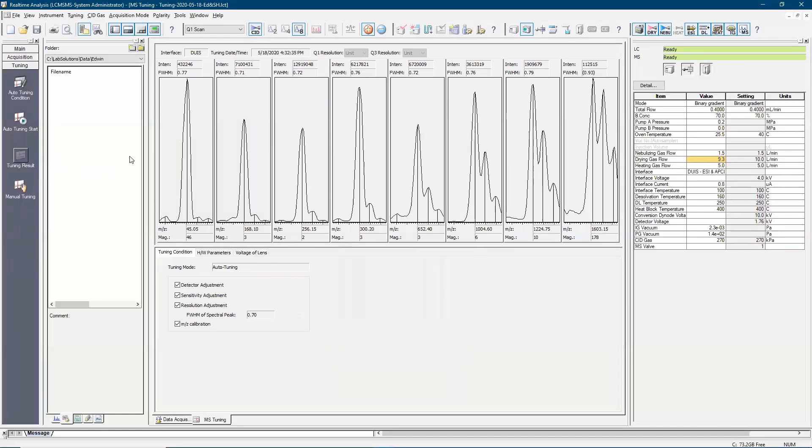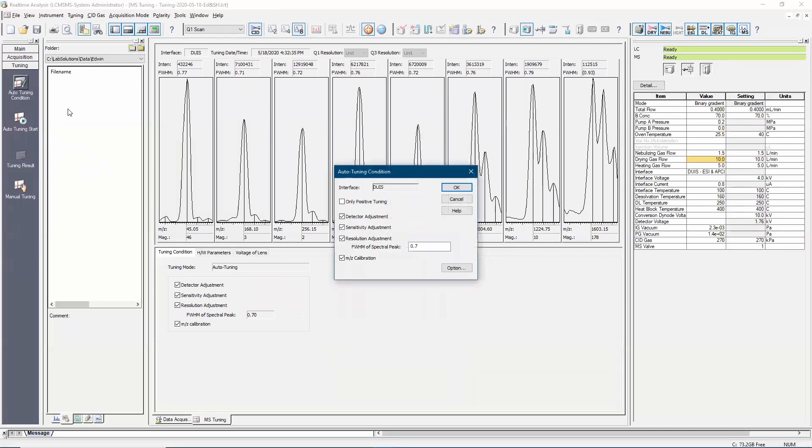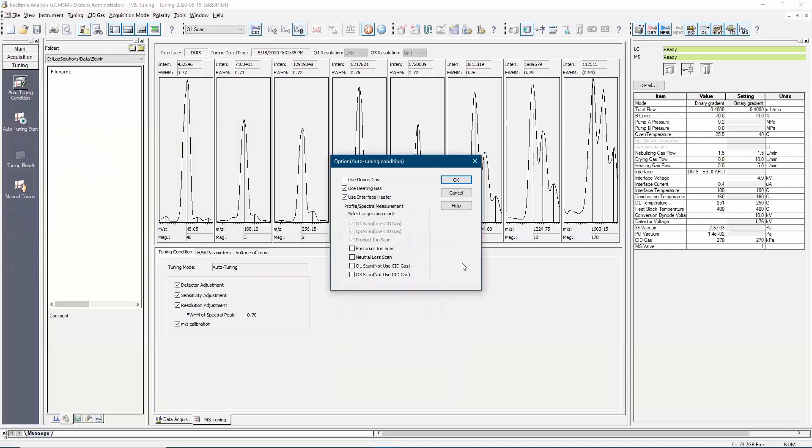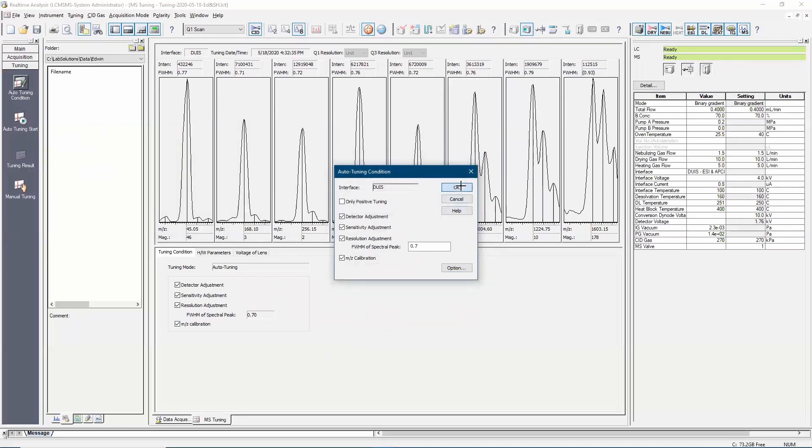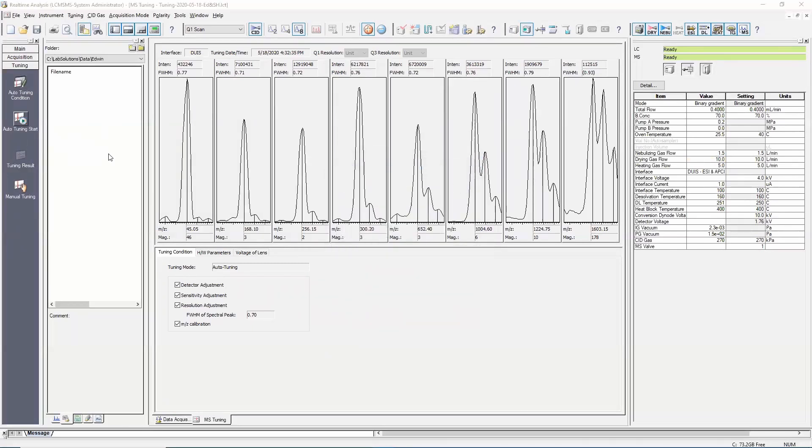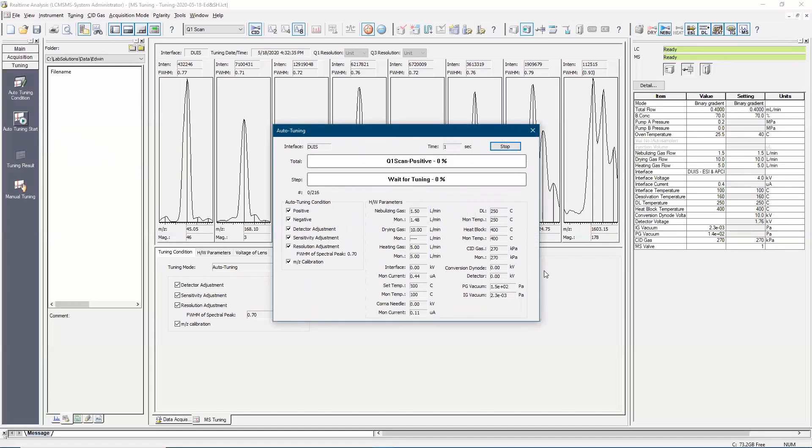Next, click on auto-tuning condition icon and ensure that detector adjustment, sensitivity adjustment, resolution adjustment and M over Z calibration have been checked. Default setting values will be used for the parameters in the option windows. Now click on auto-tuning start icon to start auto-tuning.